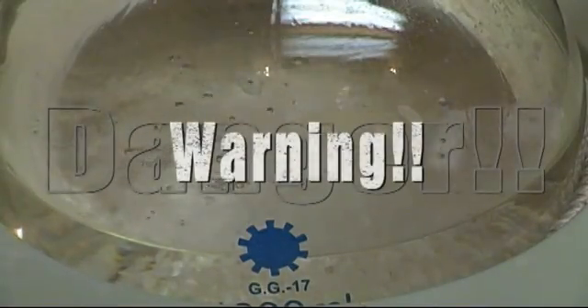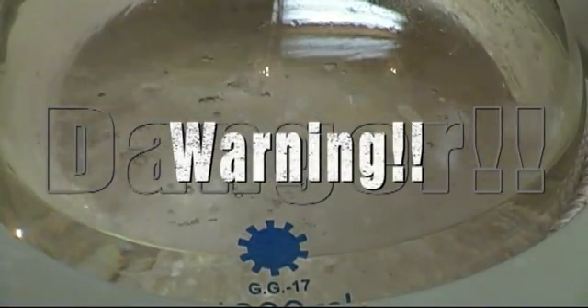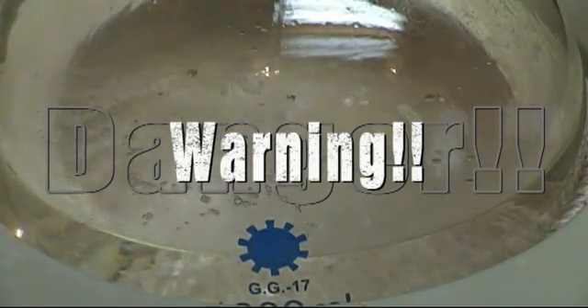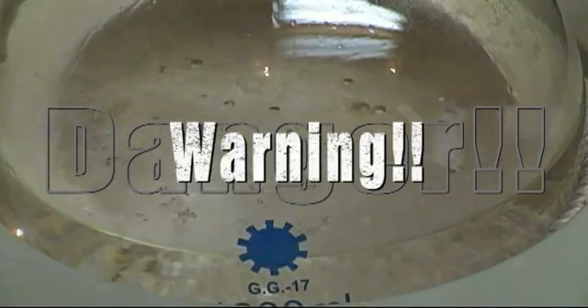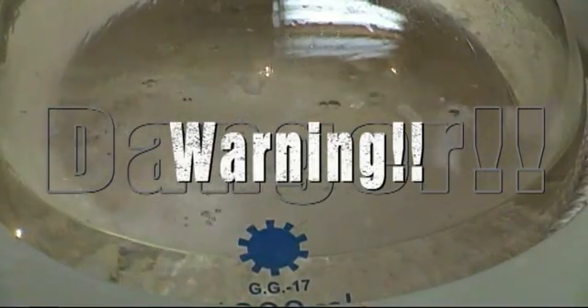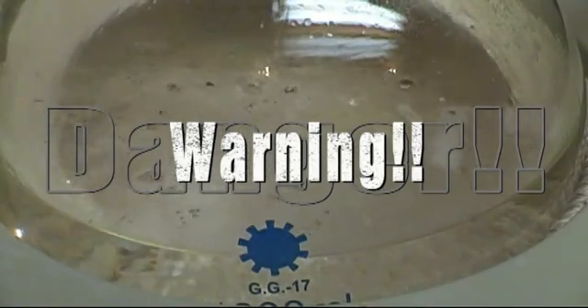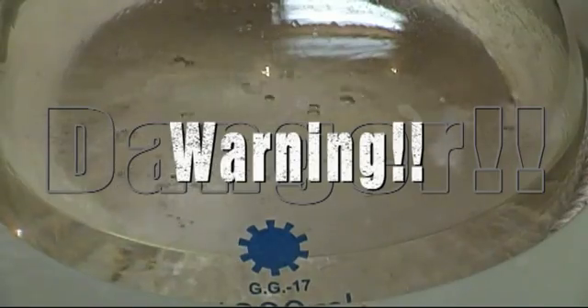Before we start, a quick warning. Ether is an extremely flammable solvent and can form explosive peroxides. If mixed with oxygen in the air it can become explosive. Ether is heavier than air and tends to hug the floors going undetected. Be sure that you perform this reaction outside or in a fume hood. Concentrated sulfuric acid is dangerous and can burn and blind you. Know and understand the risks before attempting any reaction and wear proper safety gear to avoid exposure.